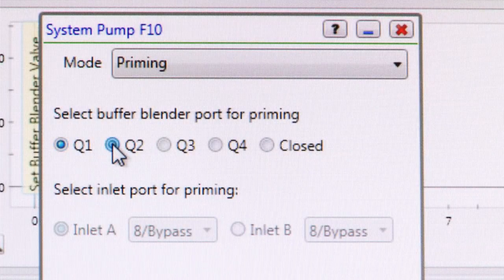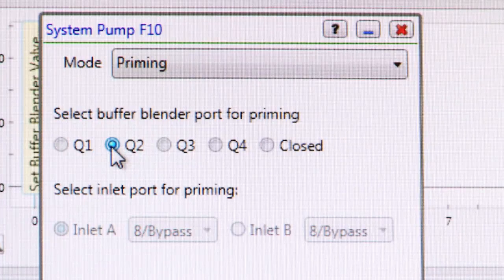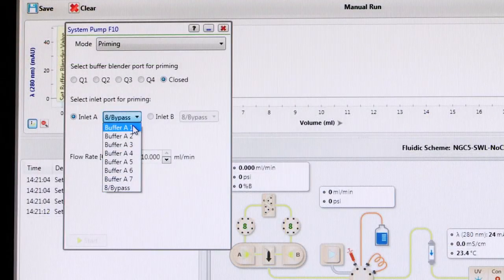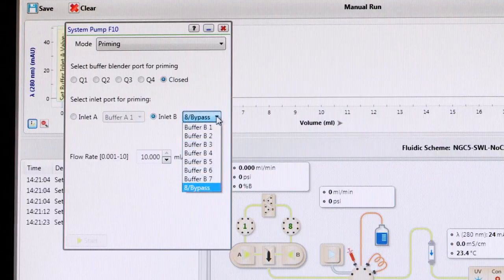Repeat these steps for the other buffer blending ports, Q2 to Q4, as shown. The buffer inlet valves may now be primed by selecting Closed in the faceplate. You may select the positions to be primed through the pump A or B manifold.